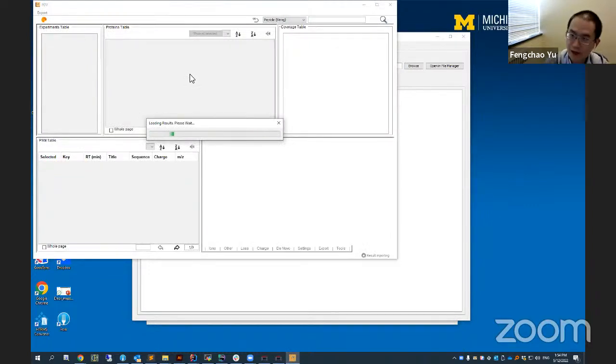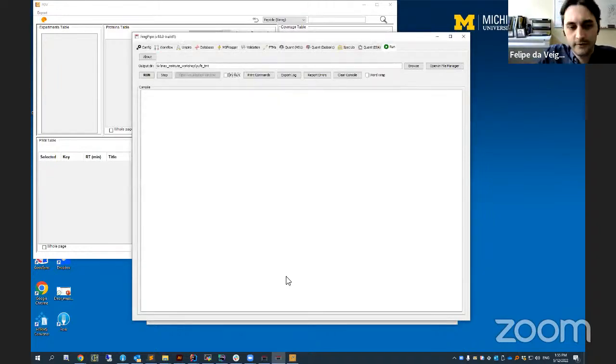Yeah, it will load the data, the TMT data I'm using, and then it will show the annotations. But the tricky part is that for the open search, depending on your settings, the modifications might not be specified as variable modifications, so you might not be able to see them in your sequence. So it might be tricky to view the open search result, but for the closed search result, it should be easy.